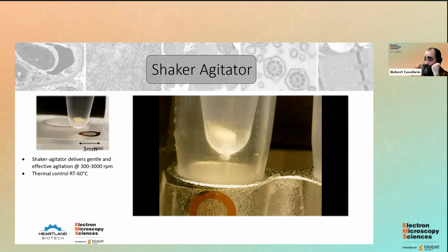And I remember when I first started working here, we had this ancient tissue processor with a color scheme of something that would be at home at the Brady house. It was from the 70s. It didn't even work very well, and I think it used more chemicals than if I were to just process stuff by hand, and it still took the same amount of time. It's an old rotary machine. We got rid of that.